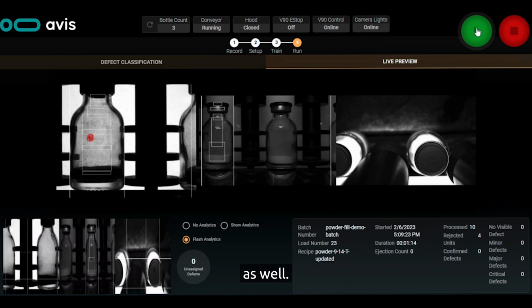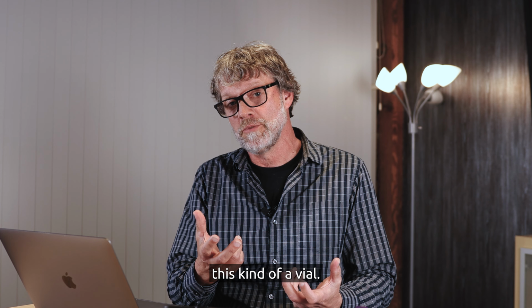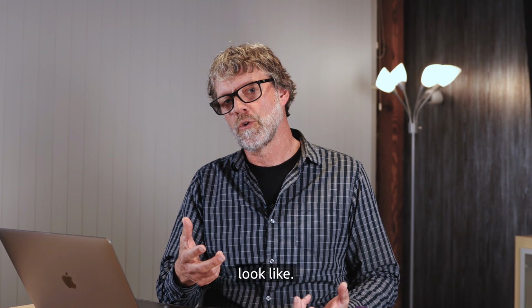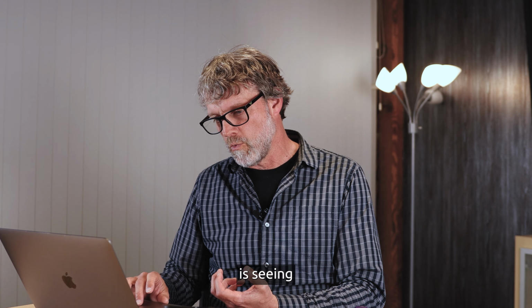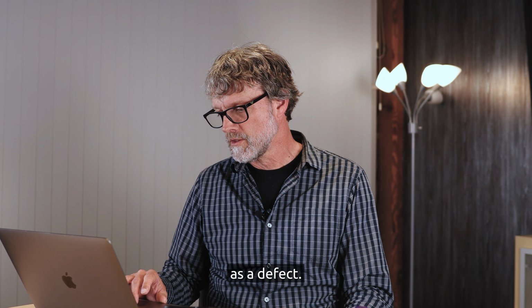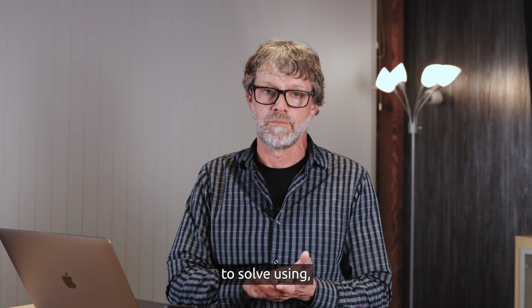This one is interesting as well. The powder that is inside the vial tends to clump and cake, and it makes little particle blotches, as it were, inside the vial, and this is why typically humans are needed to inspect this kind of a vial. However, Avis has learned all that. It learns what those types of clumps of powder look like, and so when Avis is seeing this particular one, it's saying this looks different from a clump of powder, and so it calls it out as a defect. I think it's good to point out this would be an extremely difficult problem to solve using a non-AI-based system.